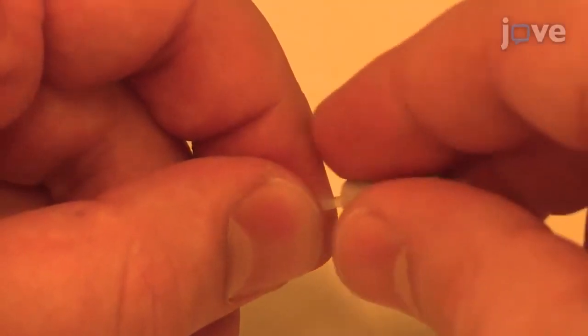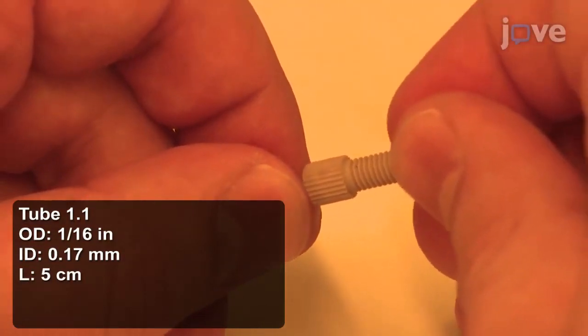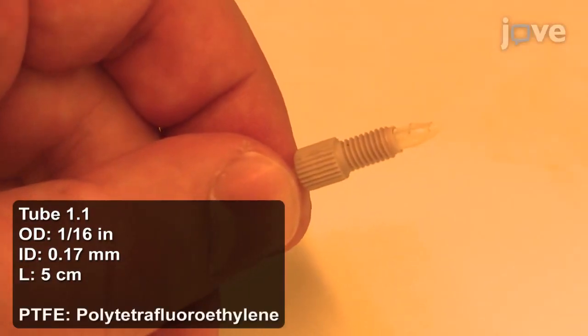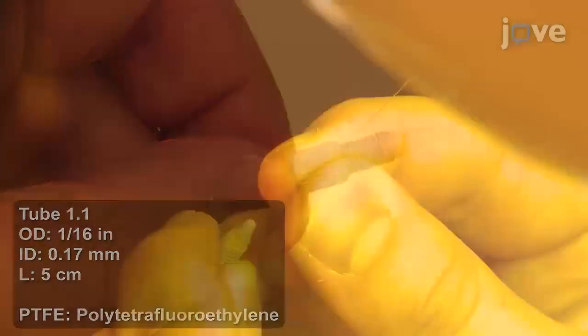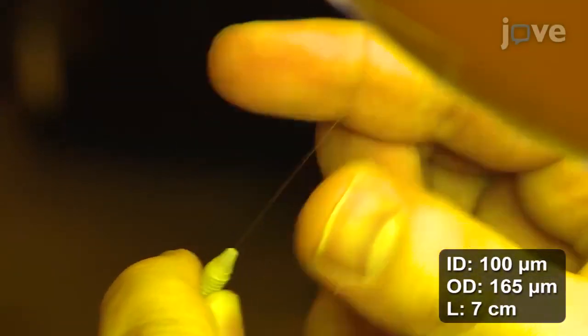Then, attach a fitting and a corresponding ferrule for the 1/16th inches outer diameter tubing to the end of a PTFE tube. Then stick the tip of a polyimide-coated silica capillary into it.